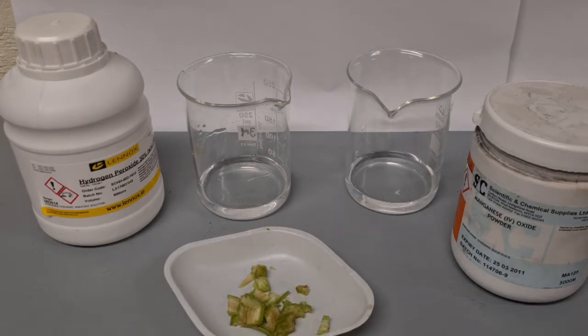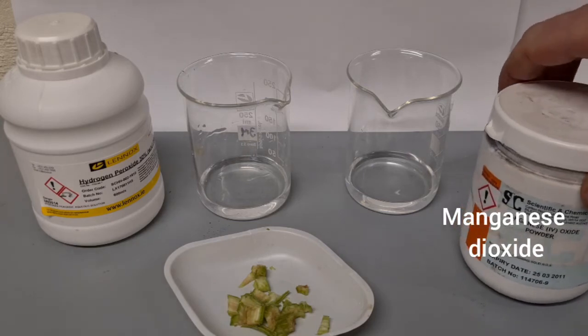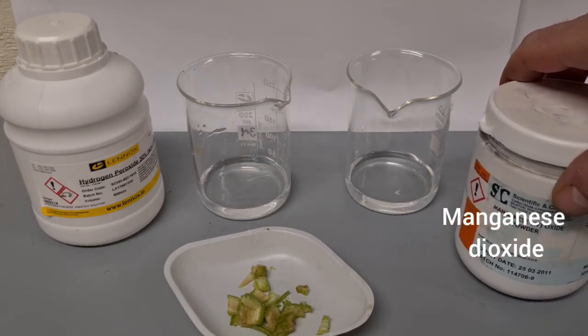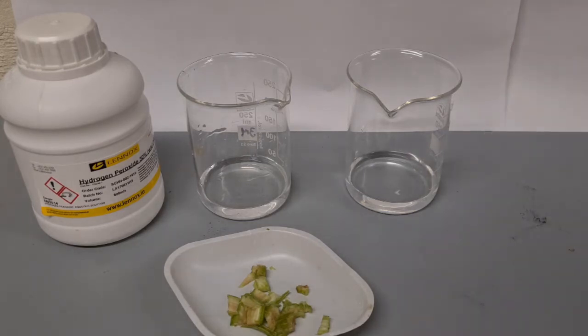An example of a catalyst that speeds up the breakdown of hydrogen peroxide is manganese dioxide. I'm going to add a small piece of manganese dioxide to one of the beakers of hydrogen peroxide.